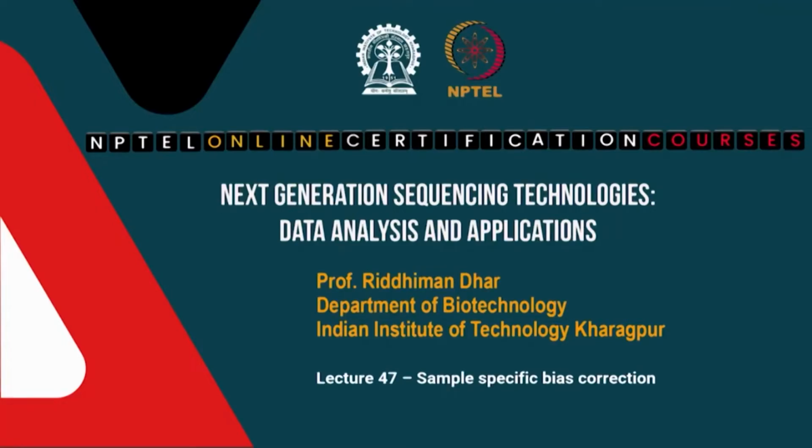We have started the hands-on for the transcriptomic data analysis, and the goal is to identify differentially expressed genes among samples that come from different conditions. So, in this class we will be talking about sample specific bias correction.